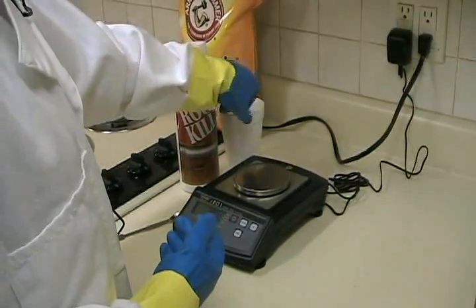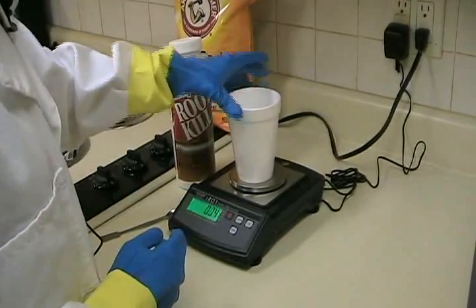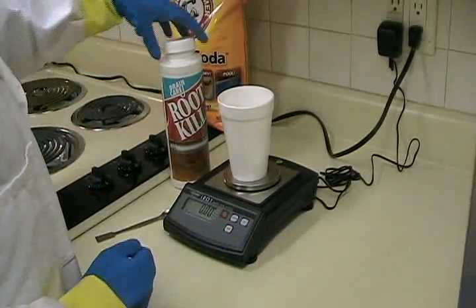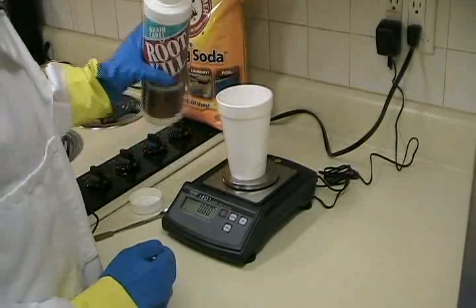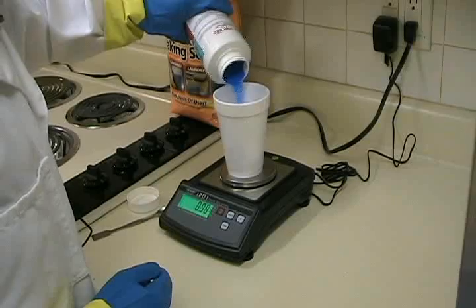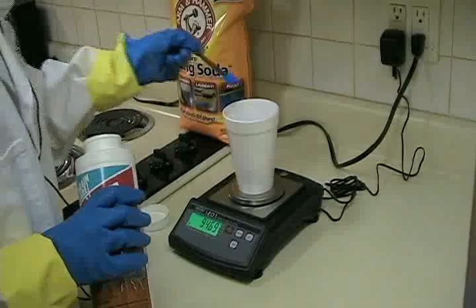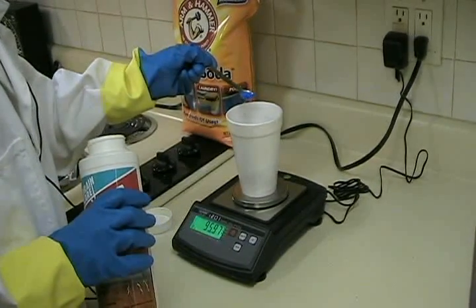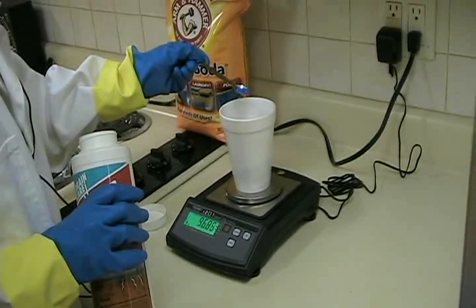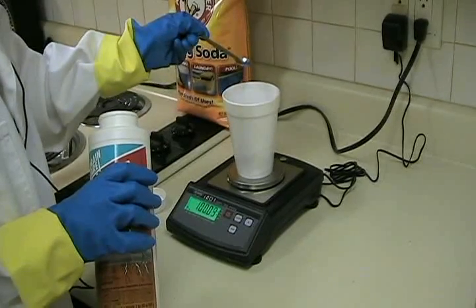We'll first begin by weighing out 100 grams of copper sulfate. Place the weigh boat on the scale and tare the scale to zero out the weight of the weigh boat. I'll begin by pouring in the beautiful blue crystals, doing a rough weigh first just to get close to 100 grams, and then use a spatula to add the crystals incrementally to hit exactly 100 grams.